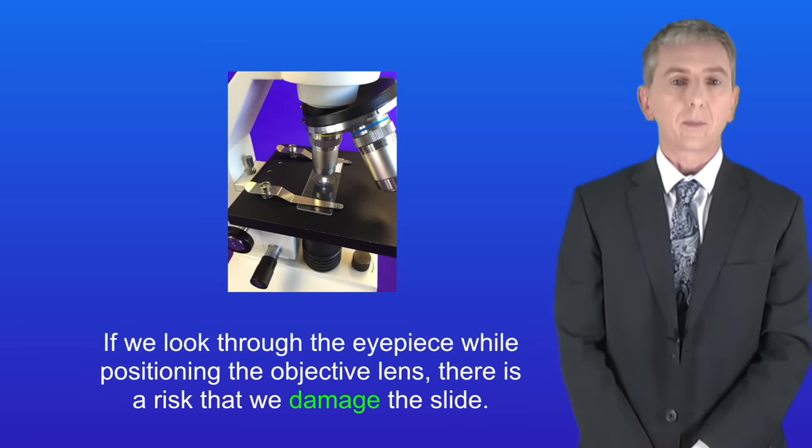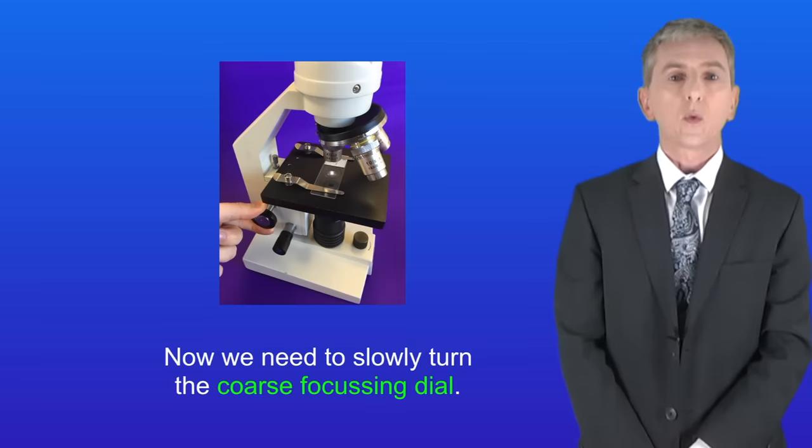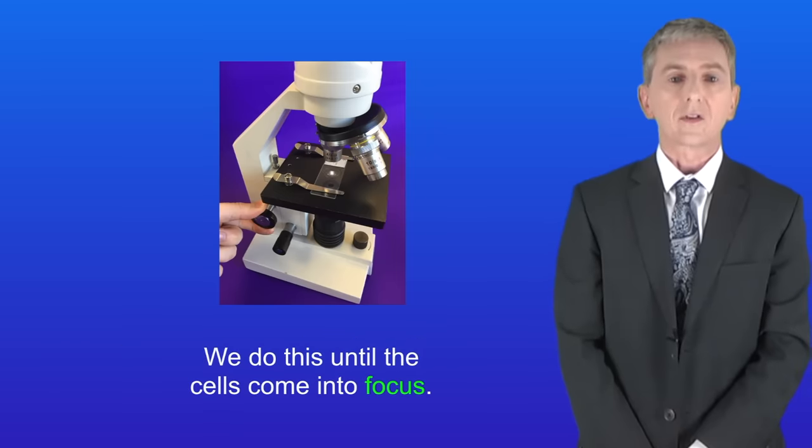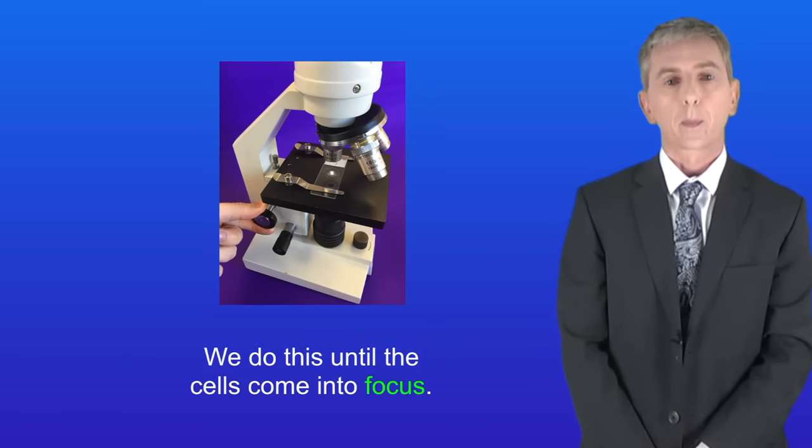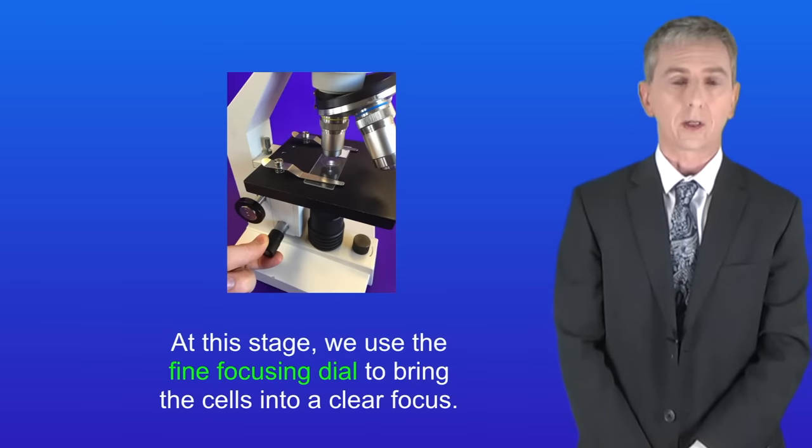If we look through the eyepiece while positioning the objective lens there's a risk that we damage the slide. At this stage we look down through the eyepiece. Now we need to slowly turn the coarse focusing dial. This increases the distance between the objective lens and the slide. We do this until the cells come into focus. At this stage we use the fine focusing dial to bring the cells into a clear focus.